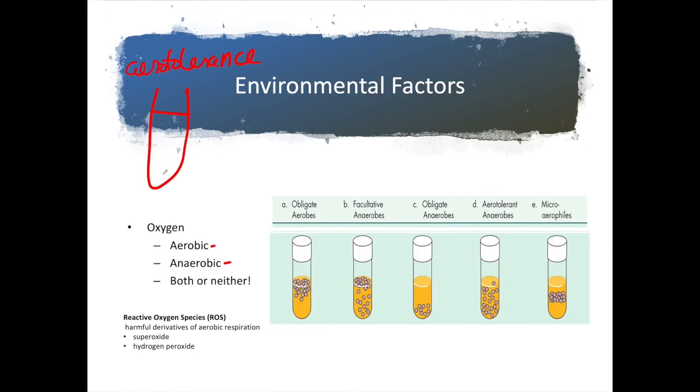Now, agar, when we make it, is in a molten form. Think of hot Jello. It's kind of viscous, in this liquid form. We pour it into these test tubes. We autoclave it to get all of the oxygen out of the media and, of course, to sterilize it. When we take it out of the autoclave, we put it in a hot water bath and keep it hot so that the agar will remain in its liquid form, somewhere around 45 to 50 degrees Celsius.